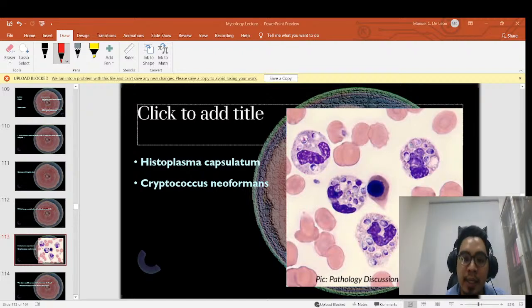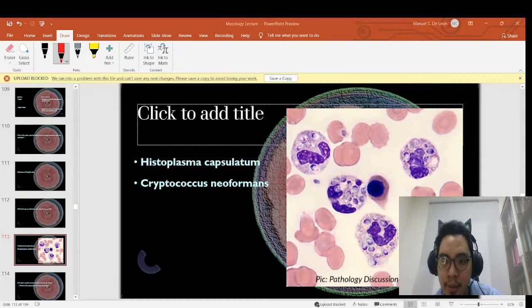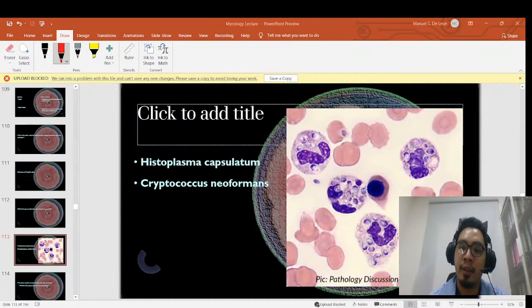What is this organism that is presented in the slide? Because this was a question in my AACP exam. I can vividly remember this question as if it was yesterday. So your choices are Histoplasma capsulatum, Cryptococcus neoformans. Histoplasma capsulatum. All right. Okay, Francis is trying to challenge everybody with his answer. Francis is posing an answer.